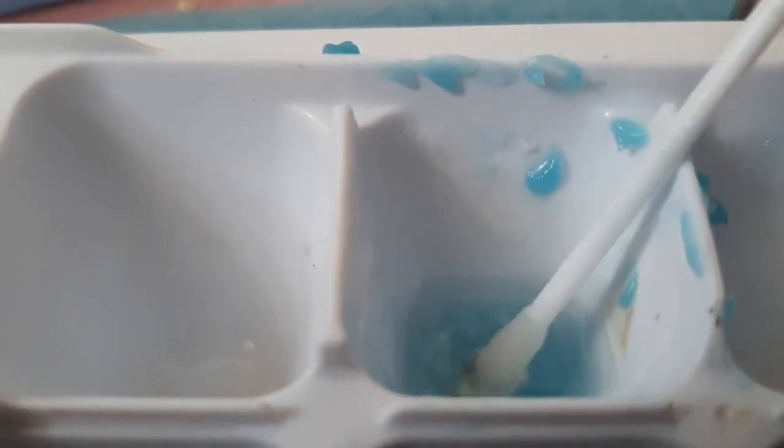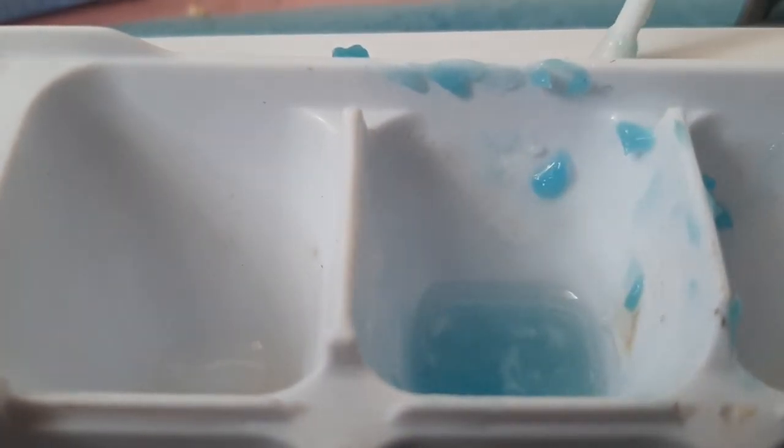I showed the structure below. If you didn't see it, you have to rewind. So mixing it would create some white substances. What are these white substances? These white substances are from the ethanol. This reacts like some kind of gooey substance. So refreezing it would also create the same one.